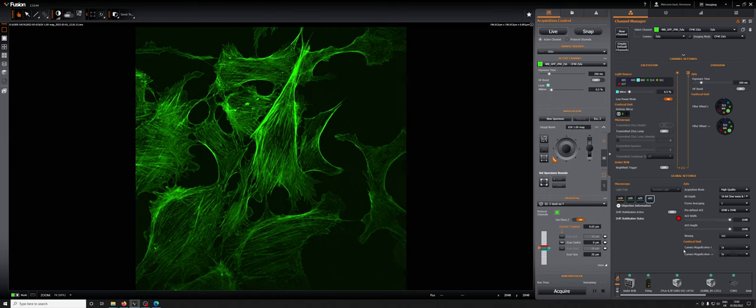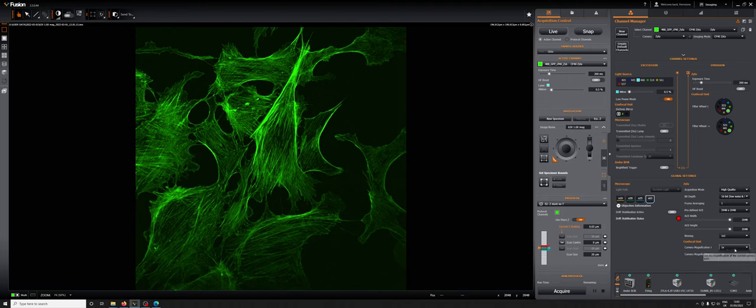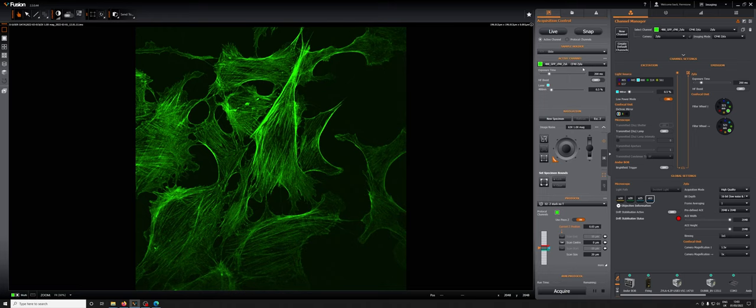The thing to keep in mind is that the one that says camera magnification up corresponds to the Zyla. So if I change that from 1 to 1.5x, you'll see it makes a little bit of noise because there's something mechanical that needs to change. If I now go to live, I will get an image with a higher magnification so the pixel size will be smaller and I'll be able to see more details.